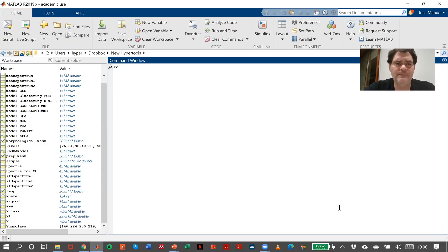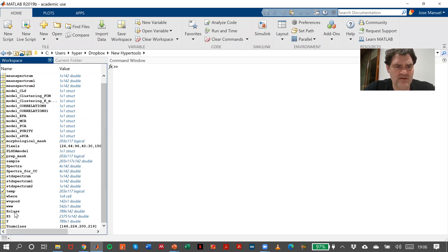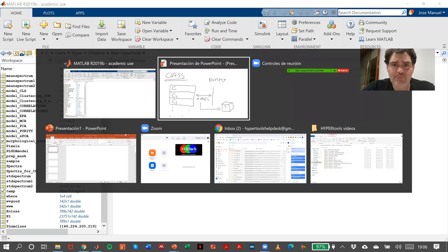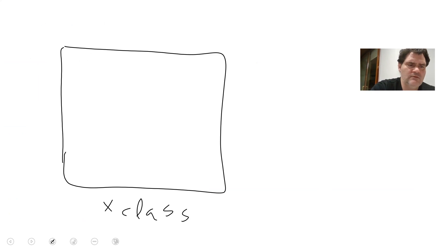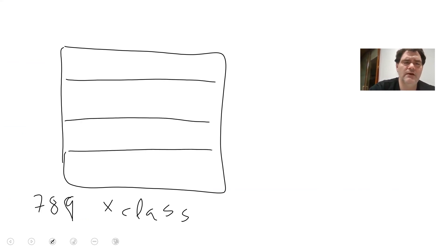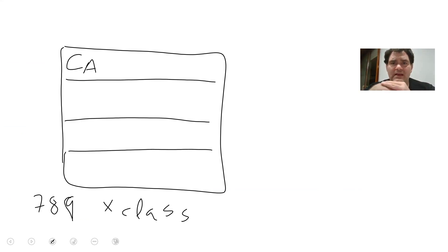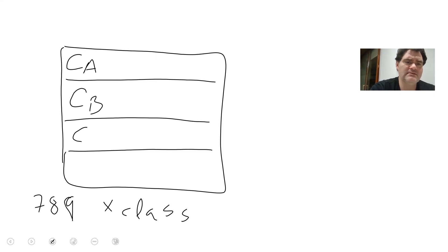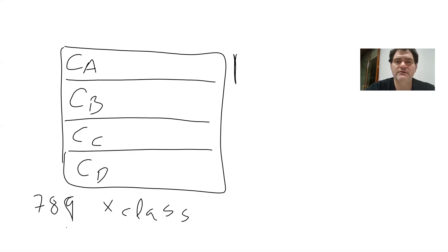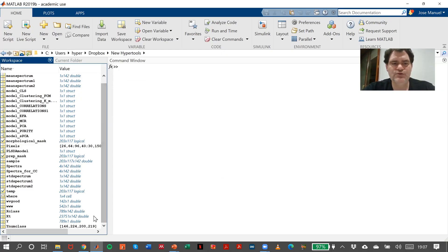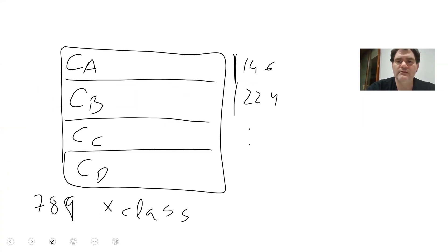Going back to MATLAB, I have already created this X matrix, which is called X class. In this X class matrix, we have 789 rows dividing four different classes: class A for the first plastic, class B, class C, and class D — we'll do it in the plastics exercise. The number of spectra for the first class is 146, for the second class is 224, and so forth.